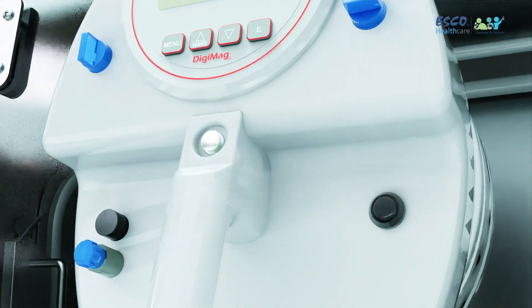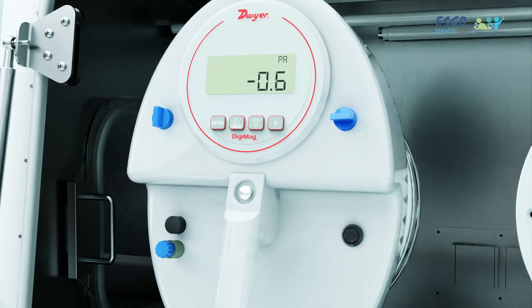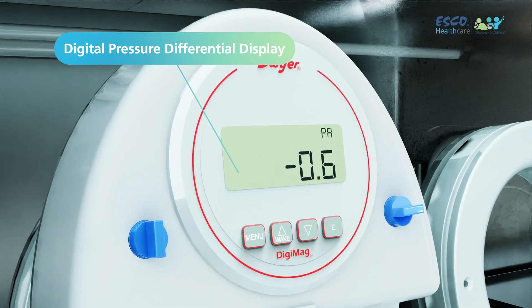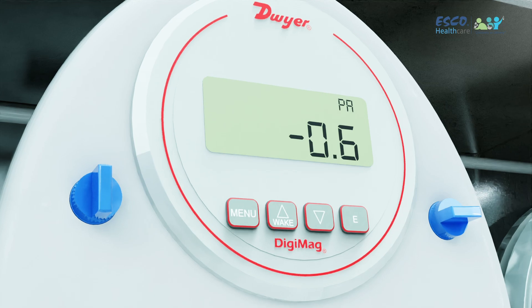Let's take a closer look at the heart of precision: the Manual Glove Leak Tester. Feast your eyes on its advanced features. First up, the Digital Pressure Differential Display — real-time feedback at your fingertips, ensuring accuracy in every test.